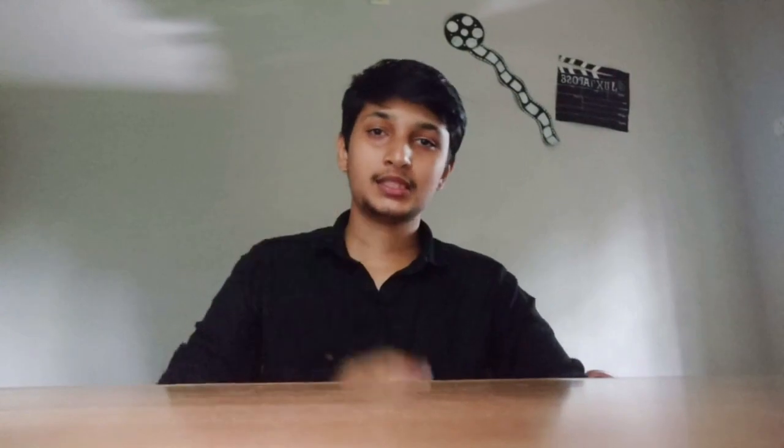This is the fourth step. Next is the fifth step. In this step, we use a primer. What is a primer? We have a sample DNA. This primer is designed to bind to a specific DNA target. If the coronavirus DNA is present in our sample, the primer will bind to it.